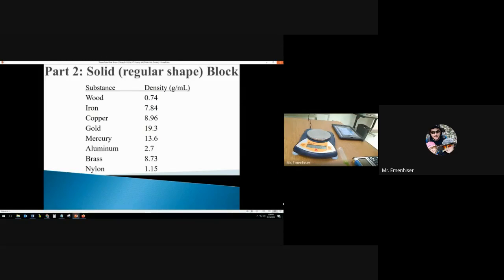All right, we're going to see, what am I doing here? I think I got to mass it first. Okay, I think I want to take wood and show a demonstration putting it in. I'm talking about density. So wood here has a density of 0.7, which is kind of low, and wood floats, doesn't it?